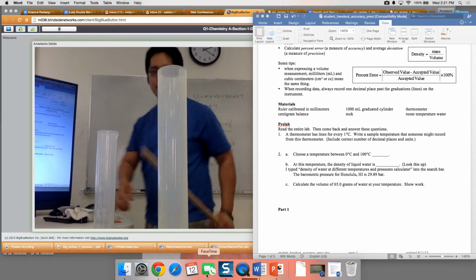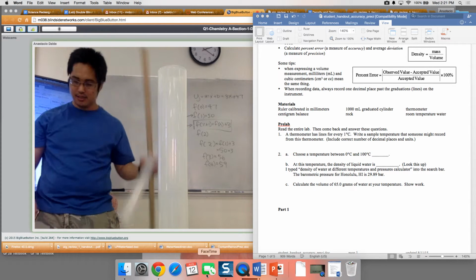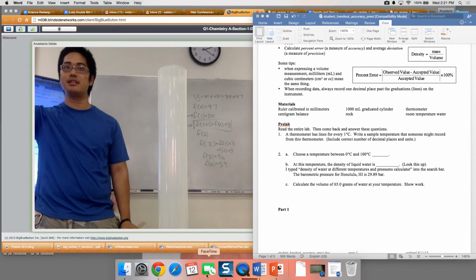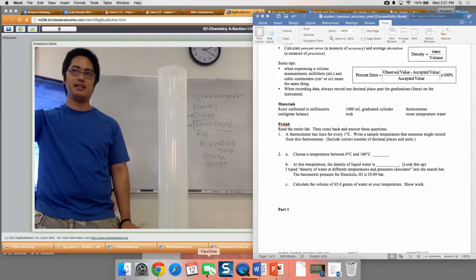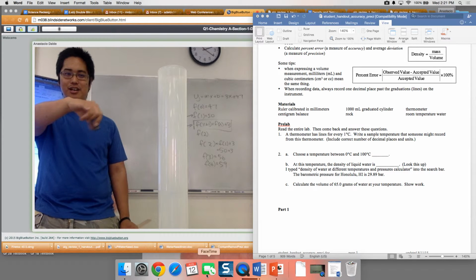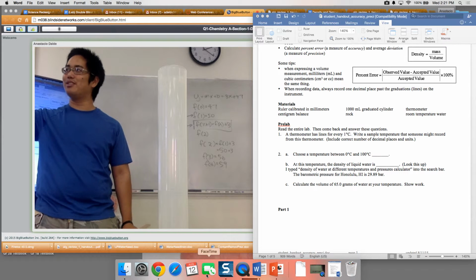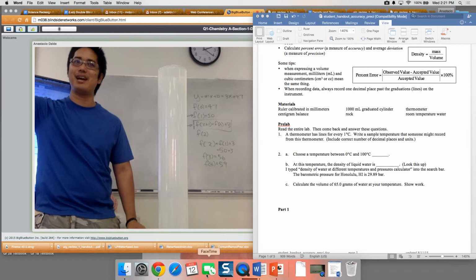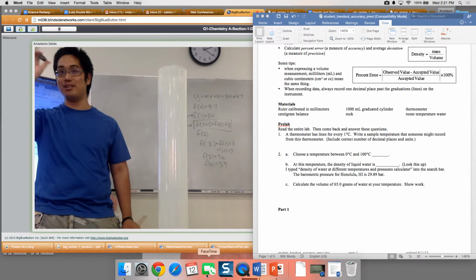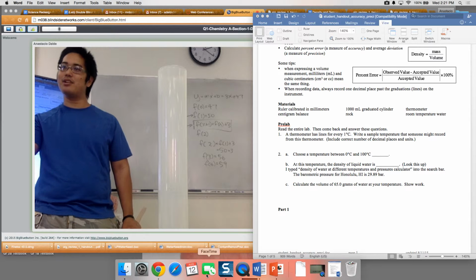We are going to measure the density of some unknown rock. Actually, I'll tell you what it is. It's called magnetite. And it is a special rock. If you break it up into really small pieces, I noticed that I couldn't plug in my power cord for the Mac computer because there was a little piece of this thing stuck, like a magnet. And then when I walked by Sarah's magnets over there, this thing is a magnetic rock. It's really interesting.